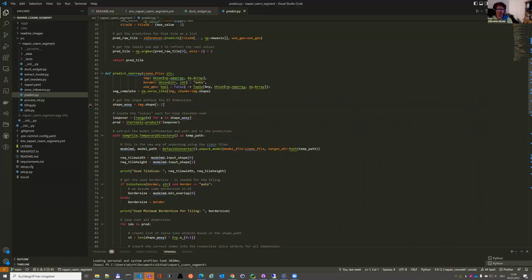Also here, feel free to give feedback to this plugin. We are not professional Napari plugin writers, but we did our best. We did it, I think, before Christmas. I said, let's have before Christmas a little internal hackathon. Let's write a little Napari plugin. And actually, it worked quite well.